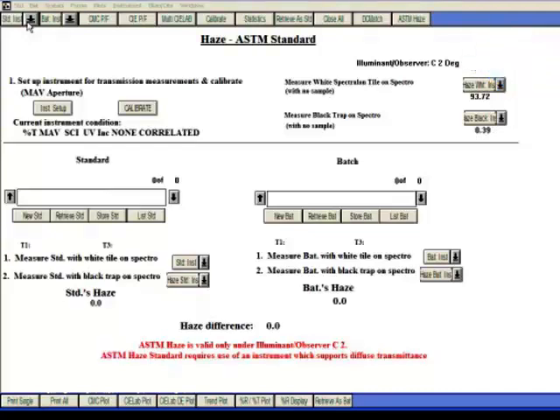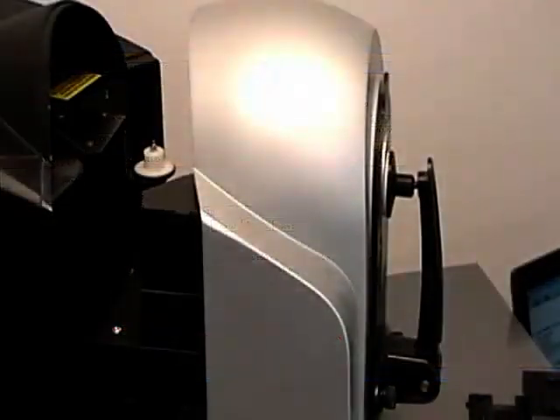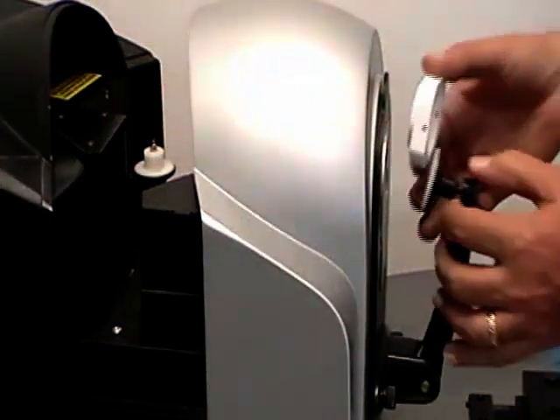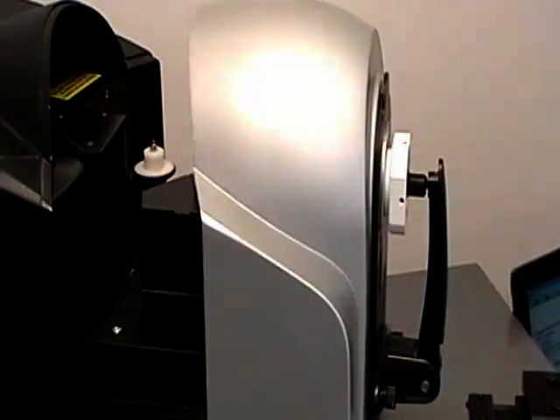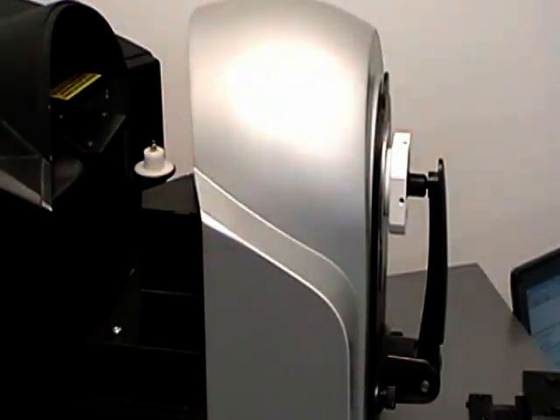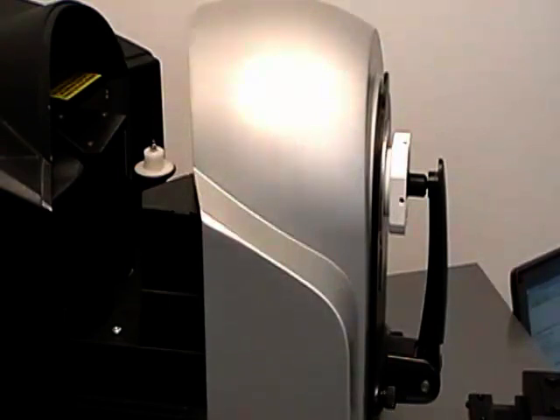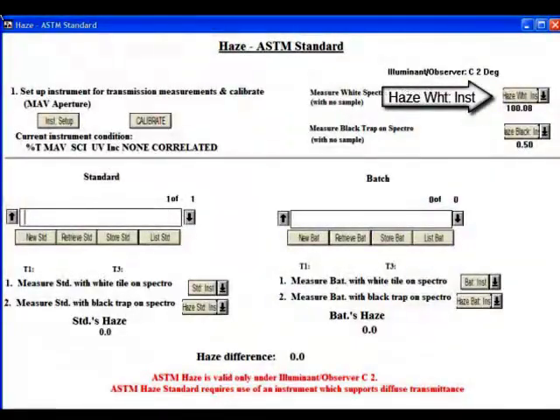With no sample in the transmission sample holder in the transmission measurement compartment, put the white SpectralOn tile in place over the aperture on the aperture plate. Measure the tile using the haze white measurement button in the upper right-hand corner of the screen form. In Tools version 2, this would be the T1 button.